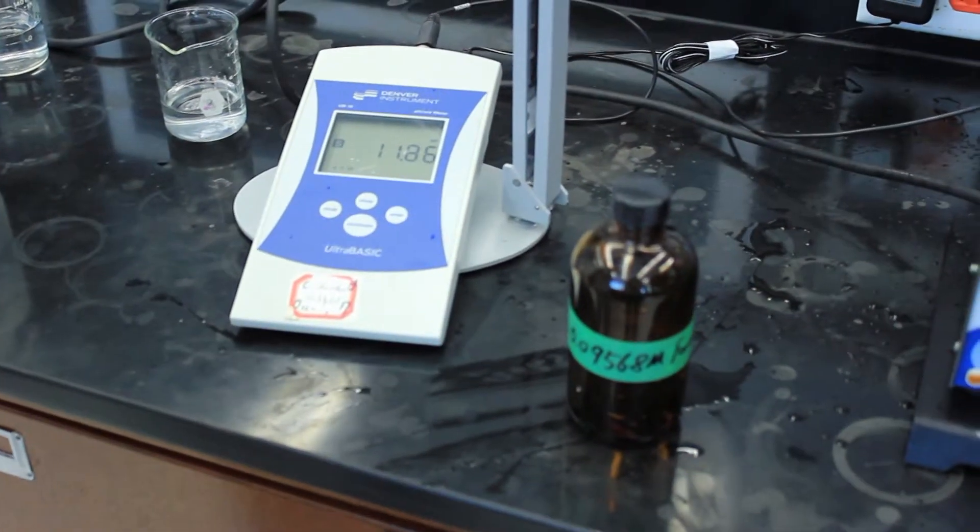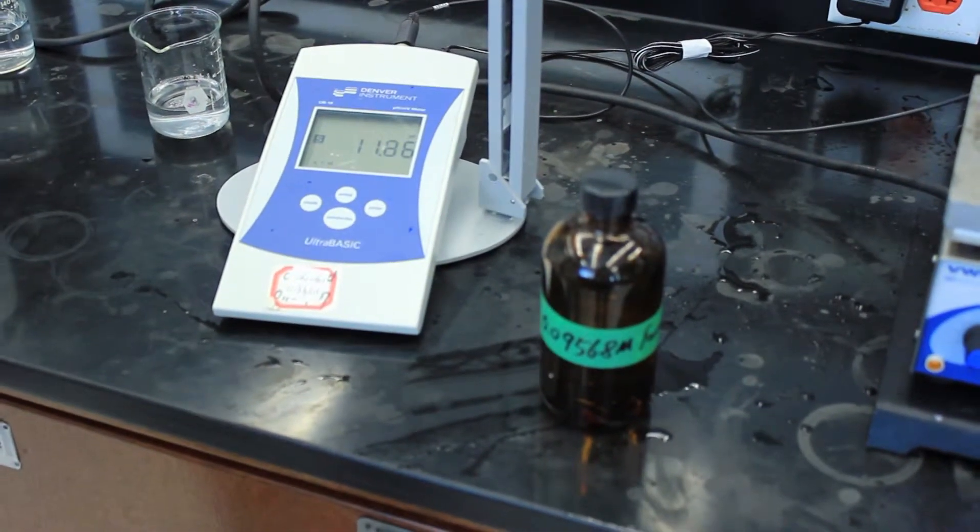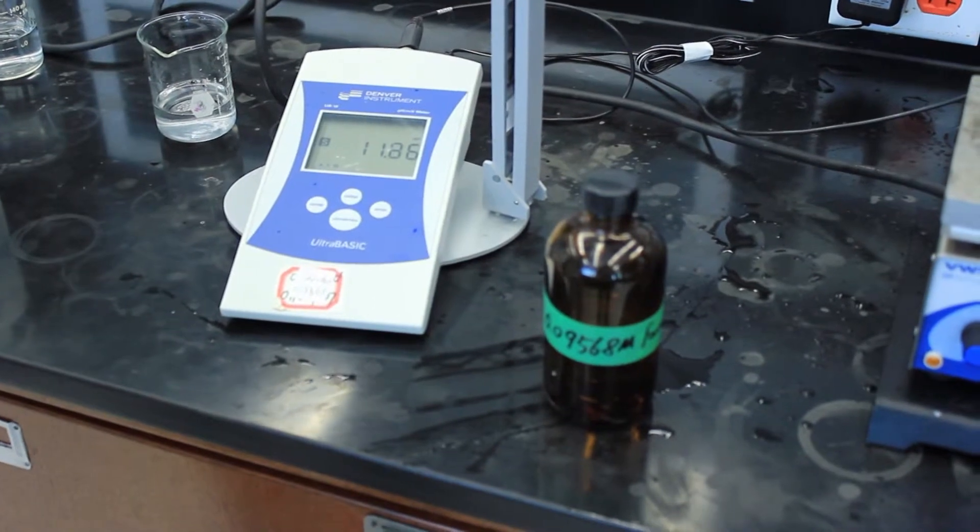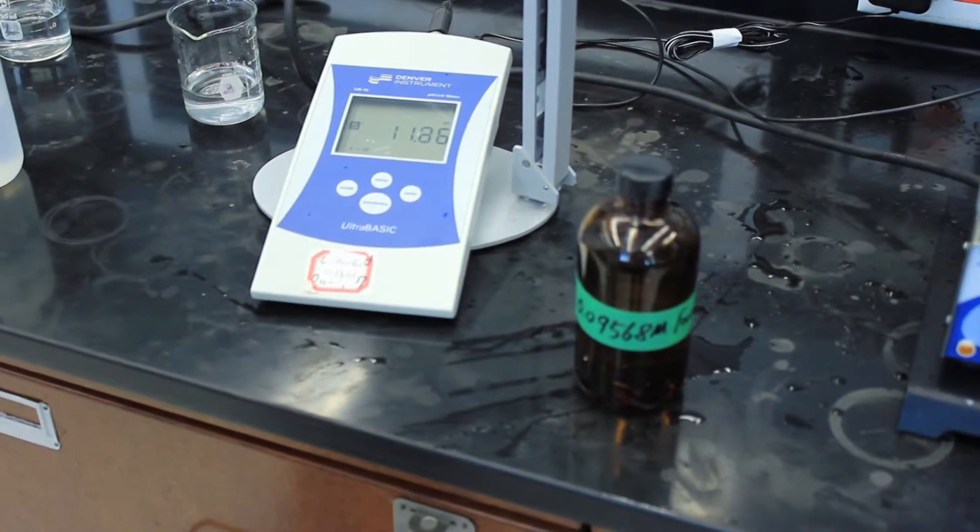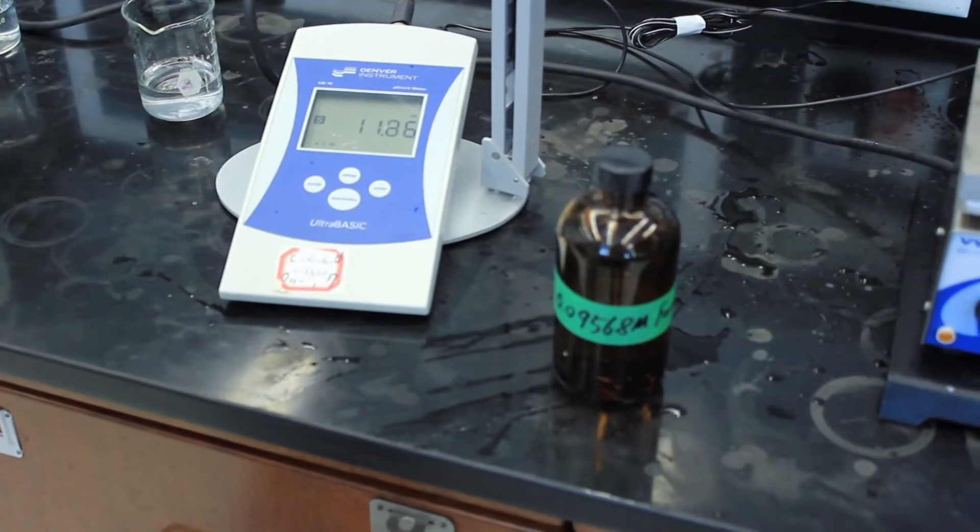For part 2 of the titration, instead of nitric acid, you're going to be using formic acid, which is a weak acid and will not dissociate completely. Repeat the procedure used for the nitric acid, but use formic acid instead.